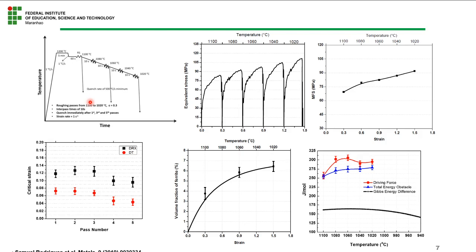In this investigation, we chose to apply very high temperature. We took a schedule from the industry that we cannot show here, but we performed the simulation to see the behavior in terms of ferrite formation from the very rough pass. This was performed over an X70 API pipeline steel.